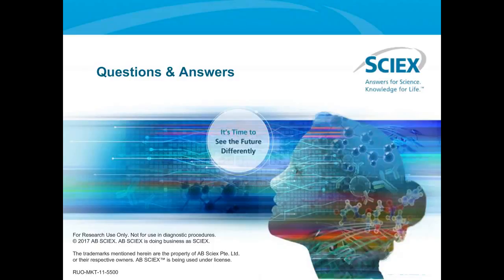Because if you would like to have full automation and you have a centrifugation step, that really increases the price of the robot you should use. With the system we worked out here, simple liquid handling systems can be used for full automation of the sample preparation, which can be done again within 60 minutes.